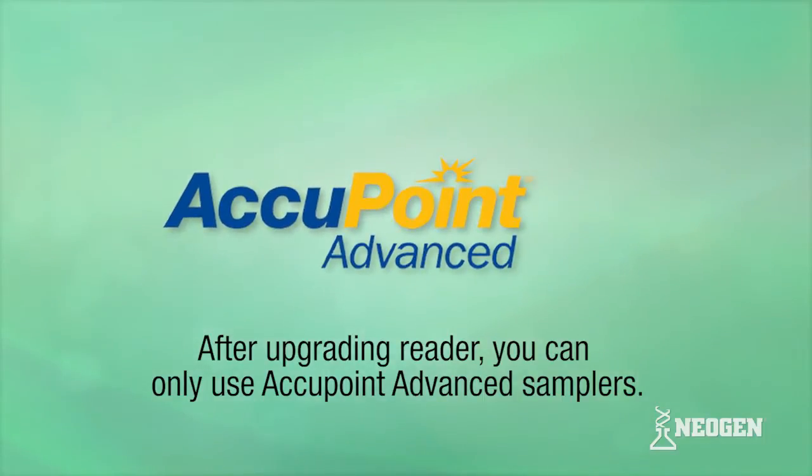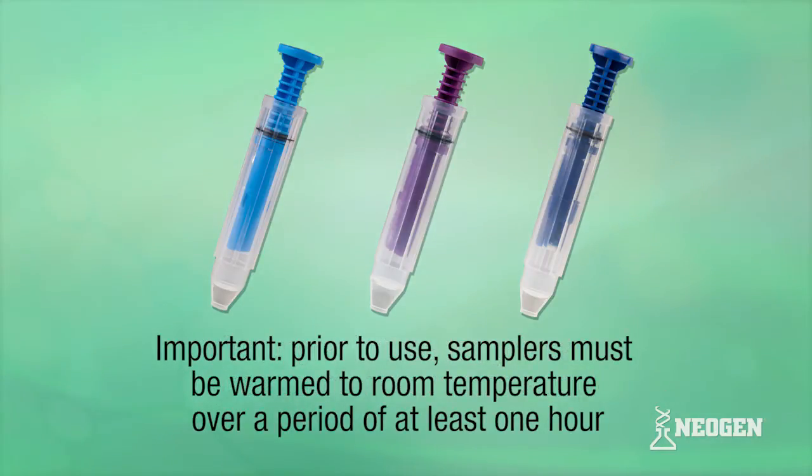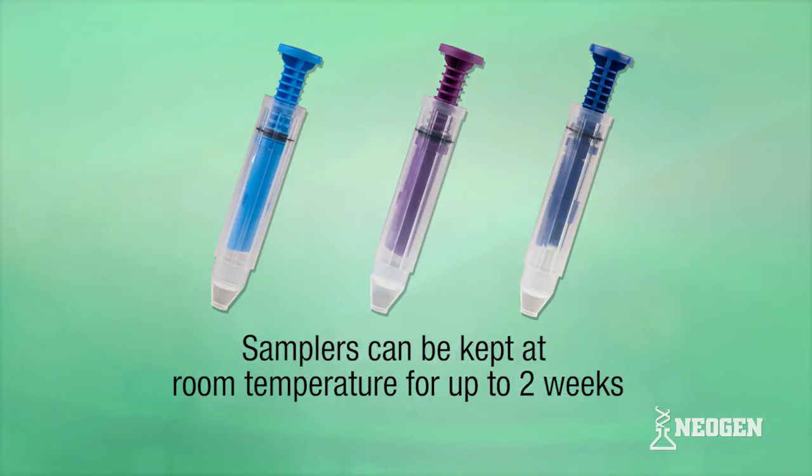Now that you've updated your reader, you can only use the AccuPoint Advanced Samplers. Please note, prior to use, the Advanced Samplers must be warmed to room temperature over a period of at least one hour. Samplers can be kept at room temperature for up to two weeks.